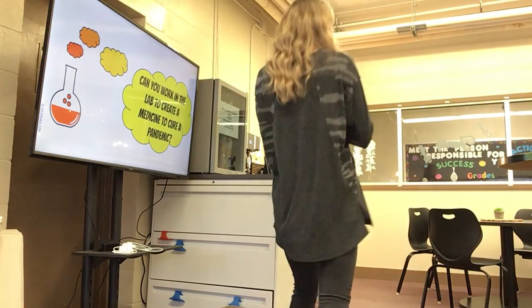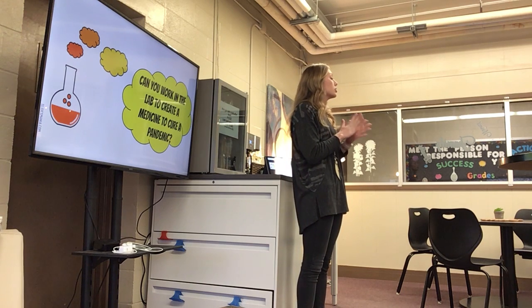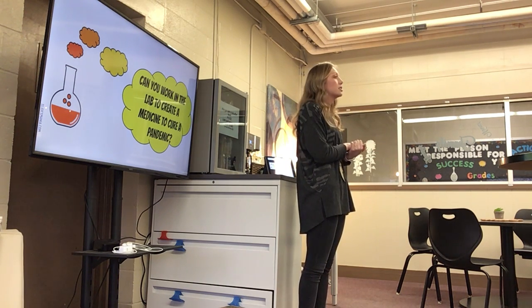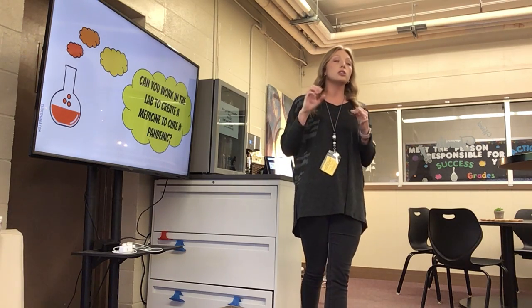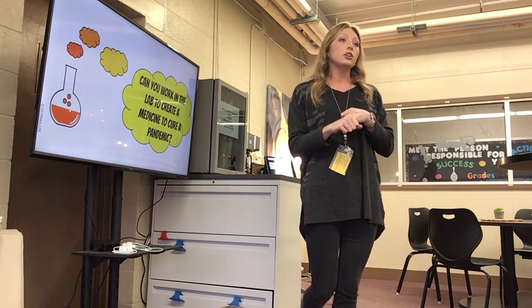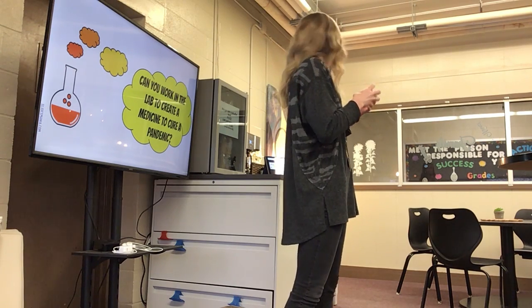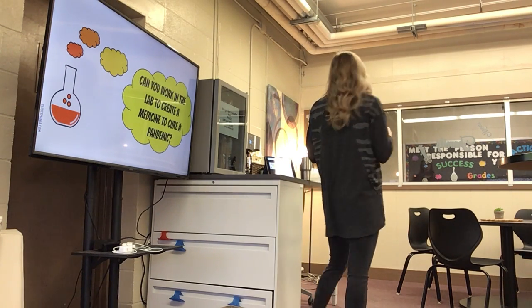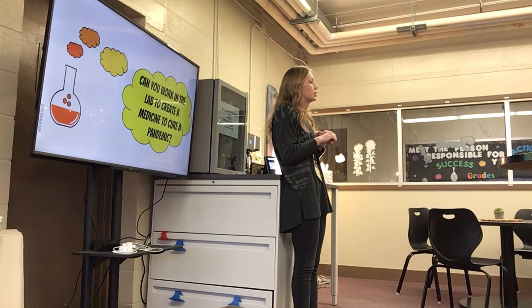Alright guys, today we will be doing our lab to explore different mixtures, compounds, and solutions. Y'all have learned about mixtures, compounds, and solutions in your task cards, your escape rooms. So today you're actually going to be mixing some things together, and you'll be able to conserve your mixtures into centrifuge tubes. So you'll be able to actually make mixtures, compounds, and solutions.